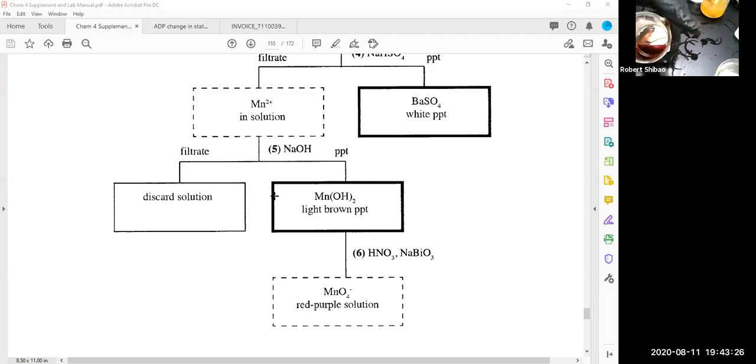Okay, now you can see it more clearly. That purple, or that grape juice solution, is permanganate. And so it's the red purple solution, permanganate. And so we tested positive. So this unknown had manganese. Unfortunately, all our unknowns only had 1 cation, so it didn't make it as interesting. I wanted more cations, but we're out of time. And if there were more cations, then we'd have some more steps to it.